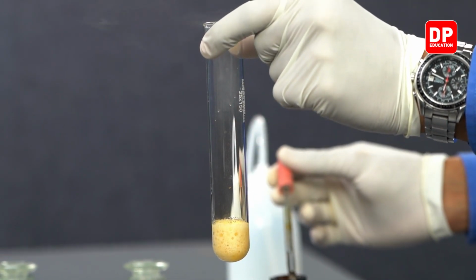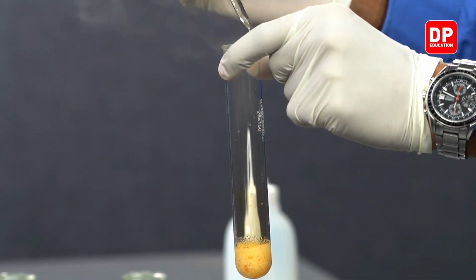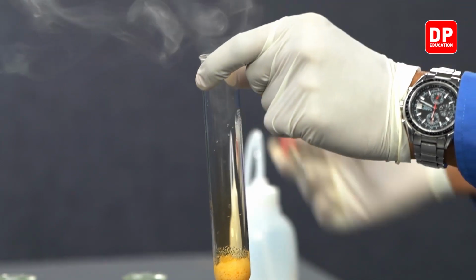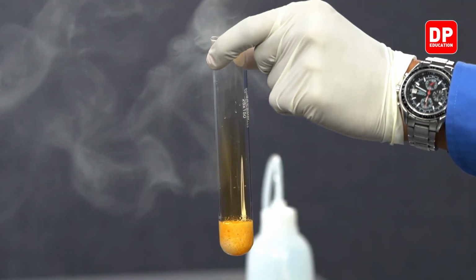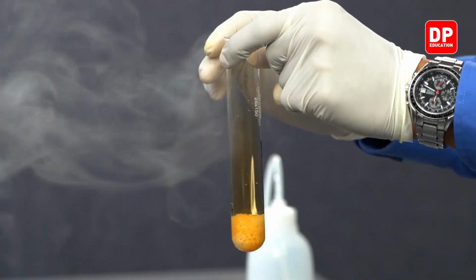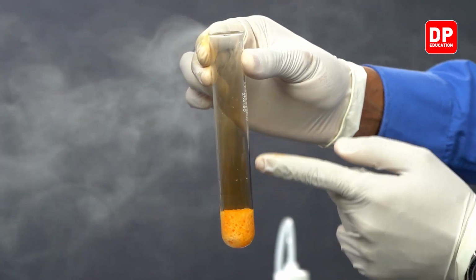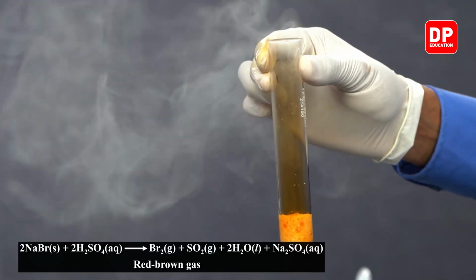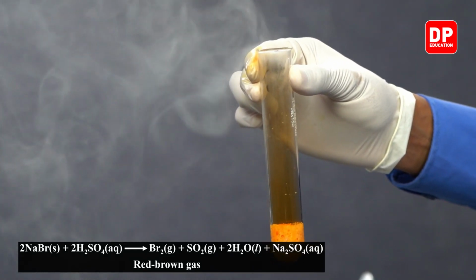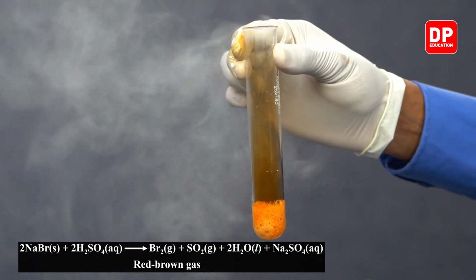You can see effervescence being formed, and it is orange in color. I'm not sure whether the camera can capture the fume being a little bit orange in color. You can see the interior walls of the boiling tube also turning a little bit orange. This is due to the formation of bromine gas.